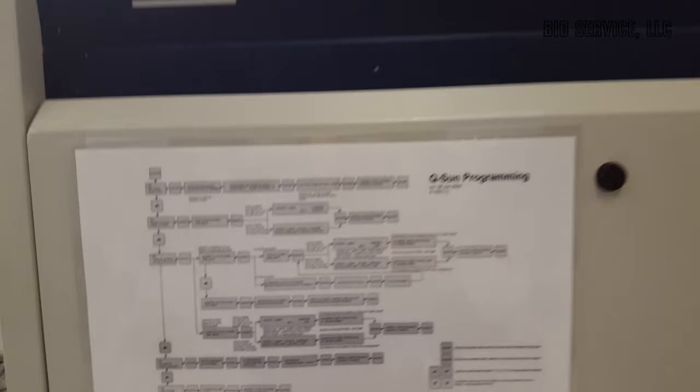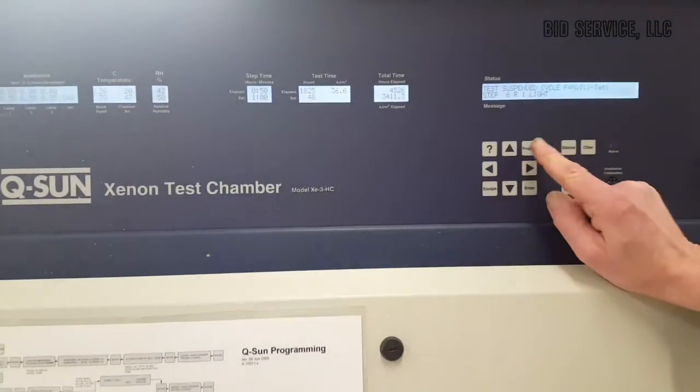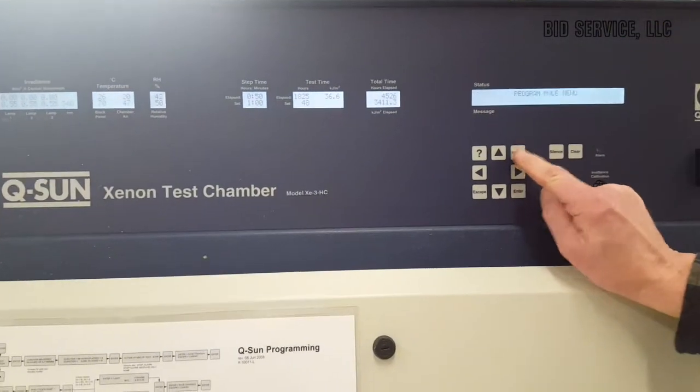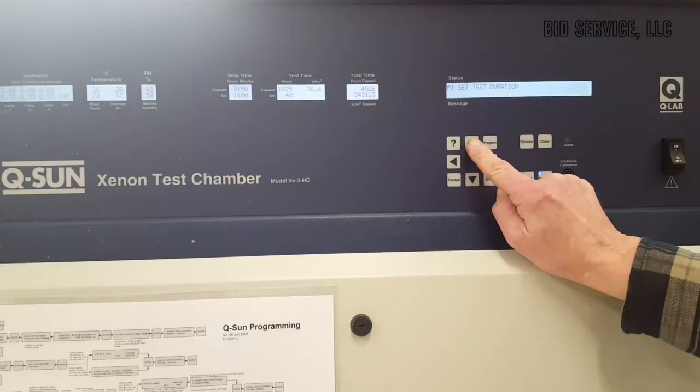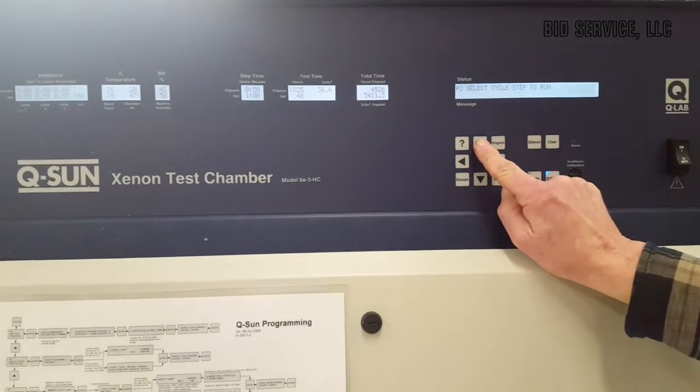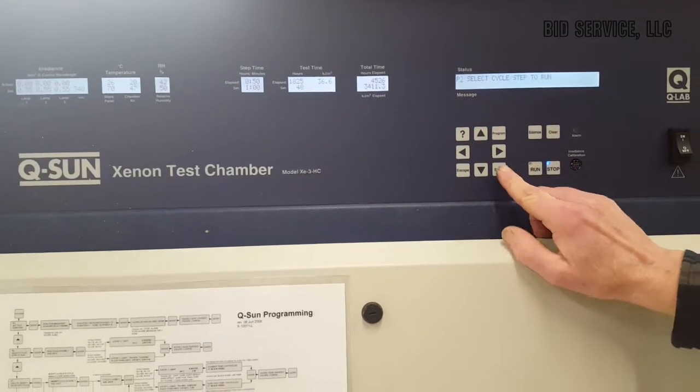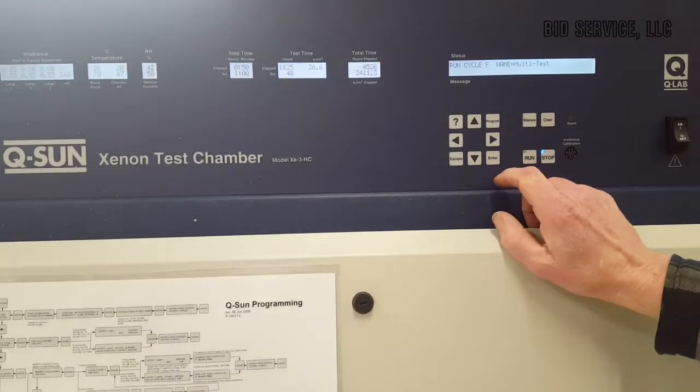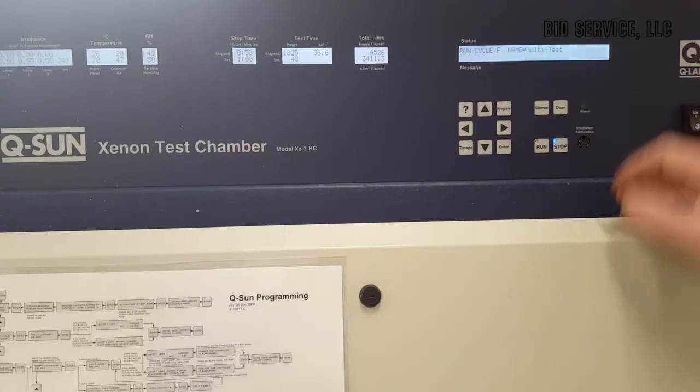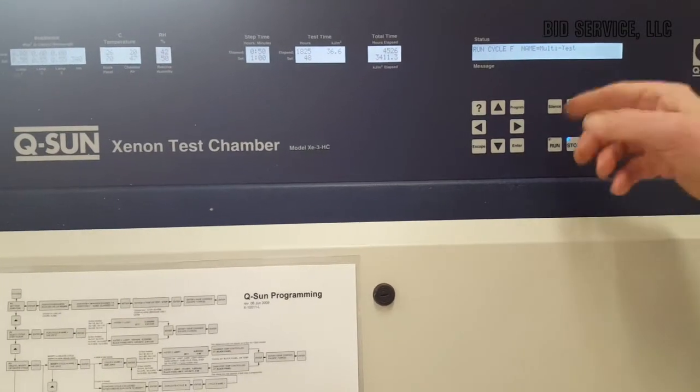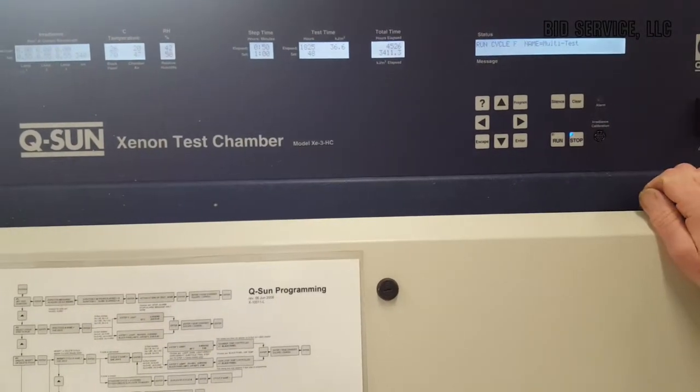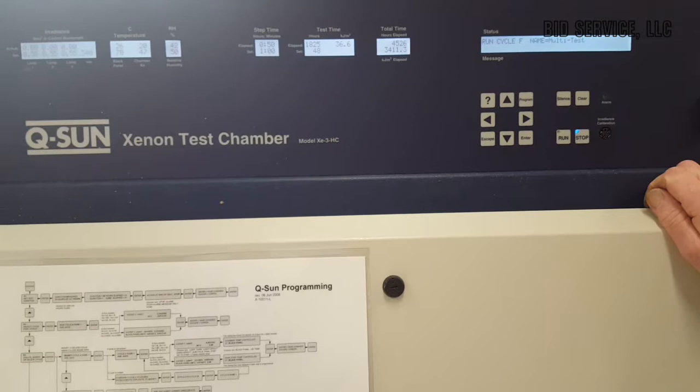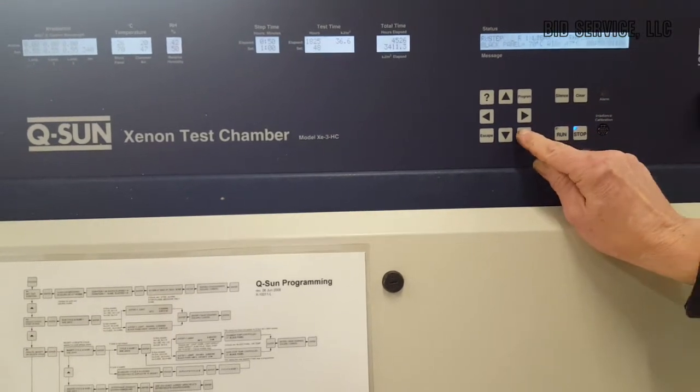What I'm going to do is I'm going to run a program today. I'm going to select my program to run, and I have written a program called F. I call it the multi-test program. So to select that, I'm going to hit enter.